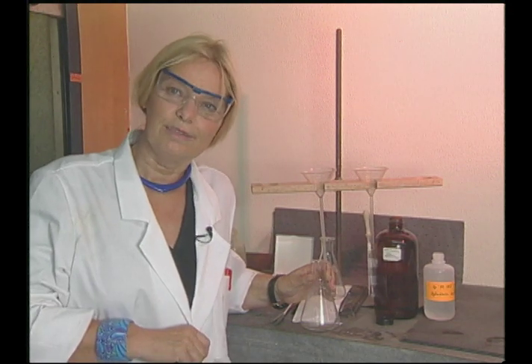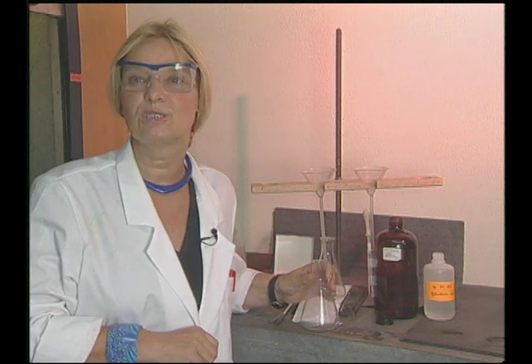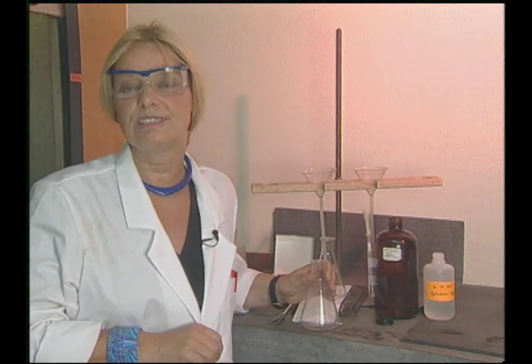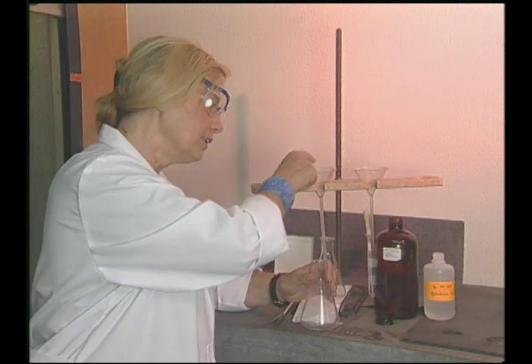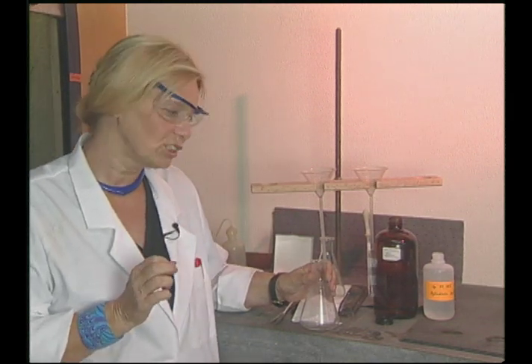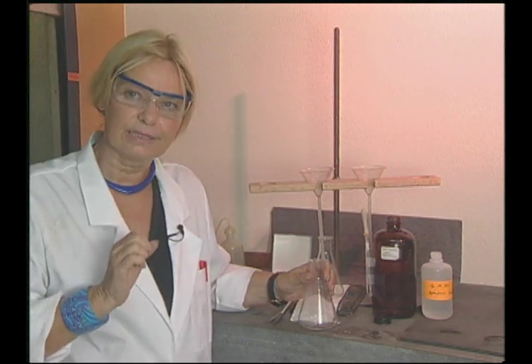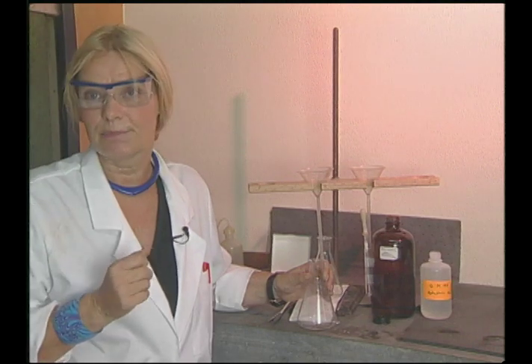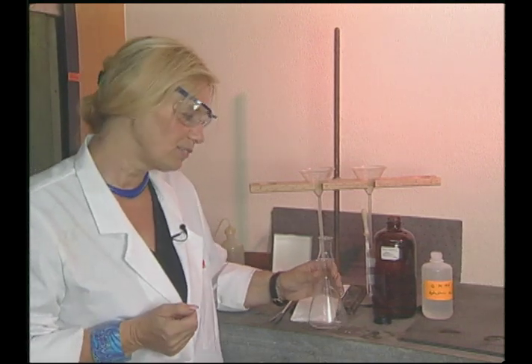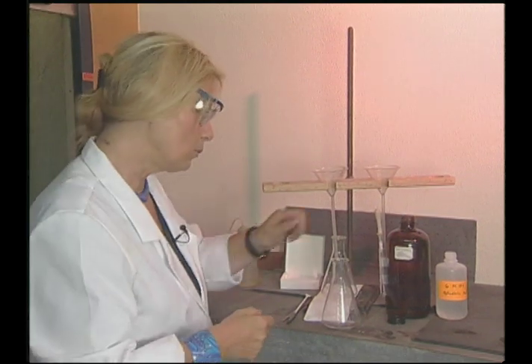Hi, we're back in the lab, and we will do a separation technique today, which is called filtration. Filtration uses a funnel, a filter paper, and a flask to collect the filtrate. Now, what is filtration? We will separate a solid from its solvent. That means that it's a bad solvent because it's not able to dissolve it anymore. But sometimes we get a solid formation in a chemical reaction, and it needs to be separated out. And that is what we will demonstrate.